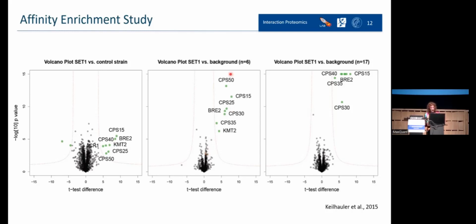And you can see here, if we increase the number of other experiments used to calculate the background, we get more significance, which makes sense. We will have more data to compare with the specific binders. So with 6 other experiments used as a background, we have this data here, and then we remove these 2 weird proteins. As you can see here, they are nice.